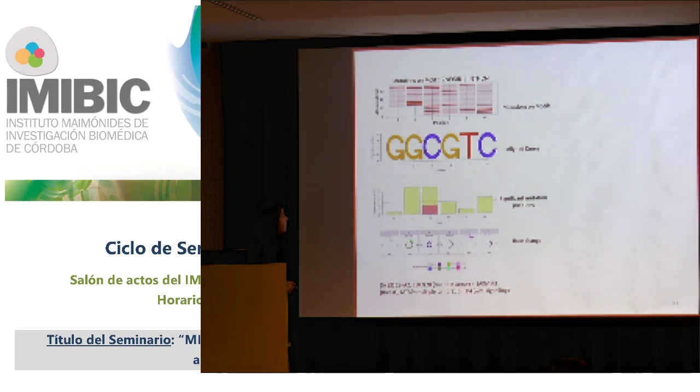And we check whether these mutations are SNPs or real mutations. We overlap this with the SNP databases to see whether, so the yellow ones are no SNPs, and the red one means this position is known for SNP.